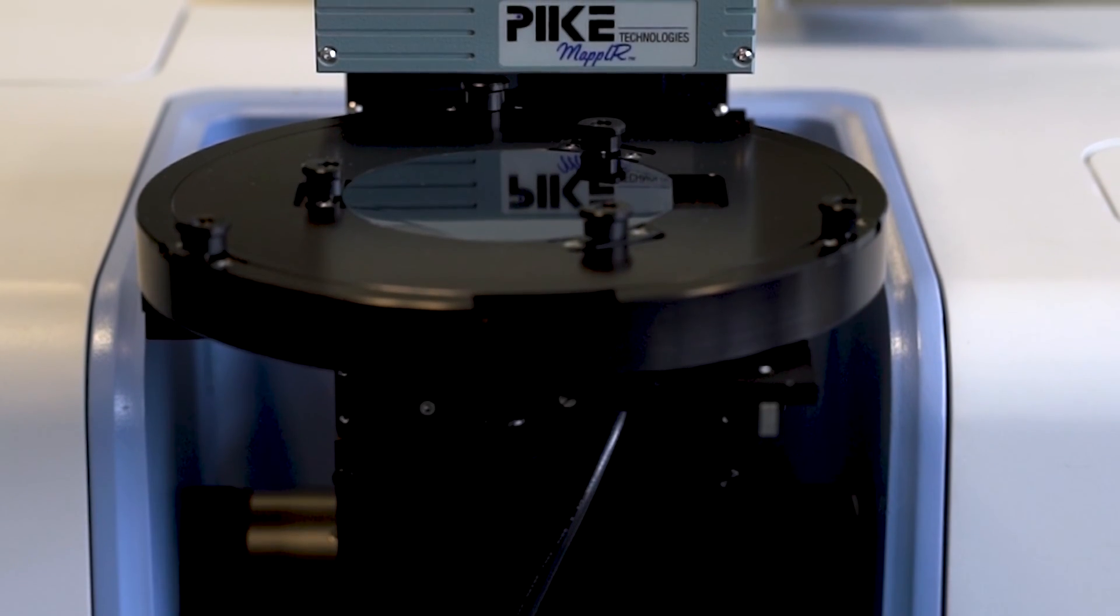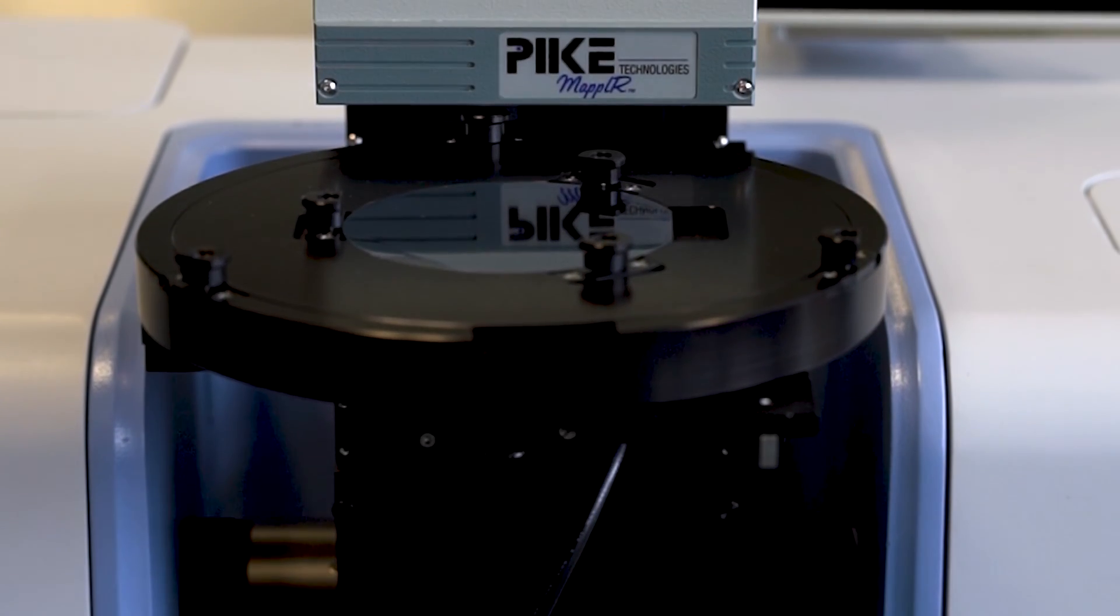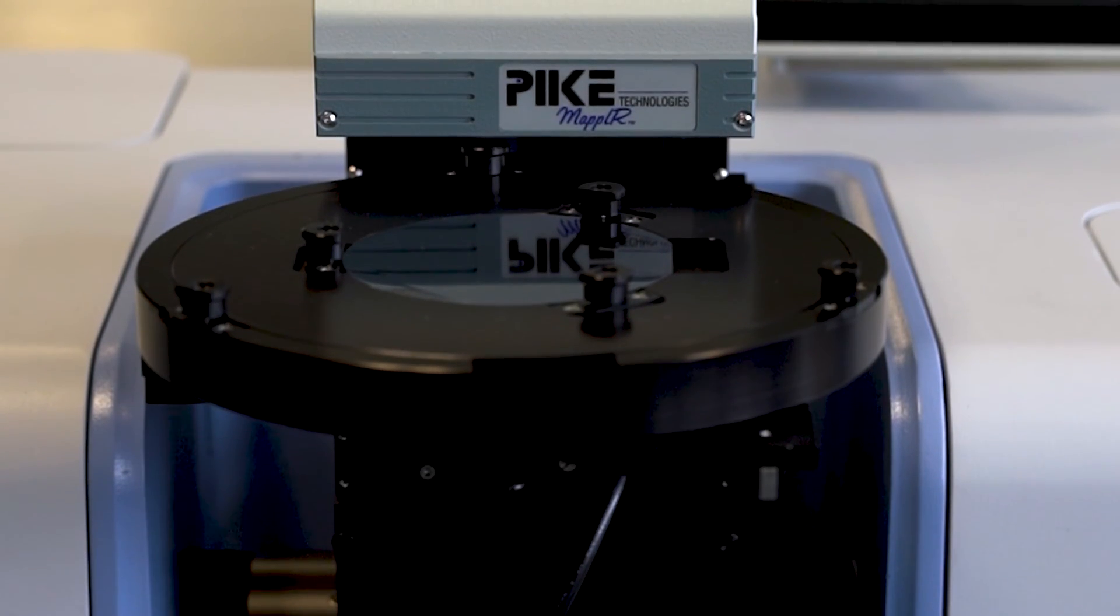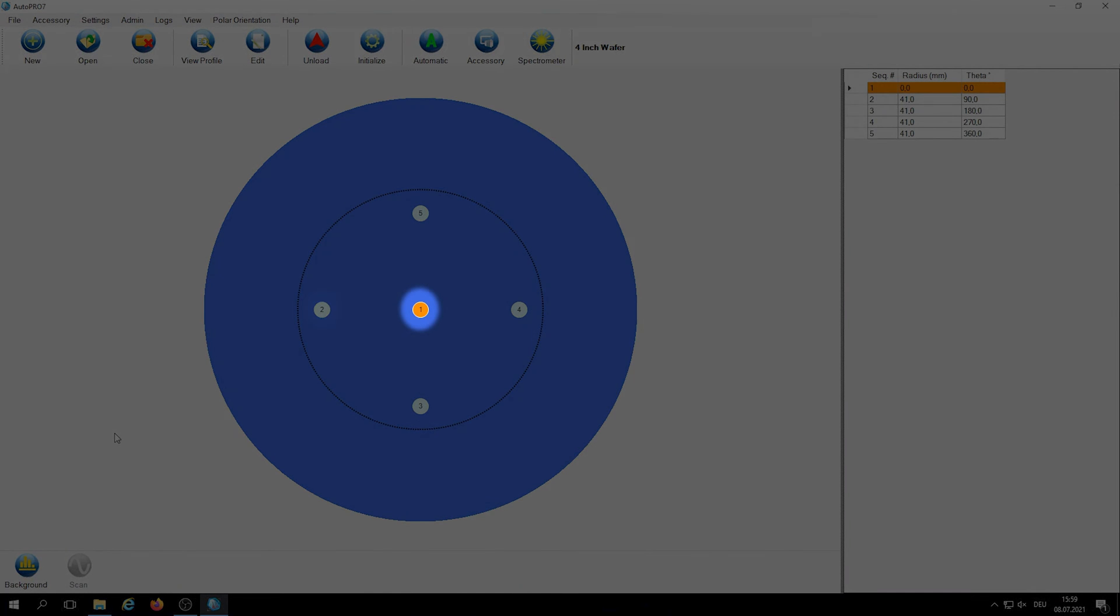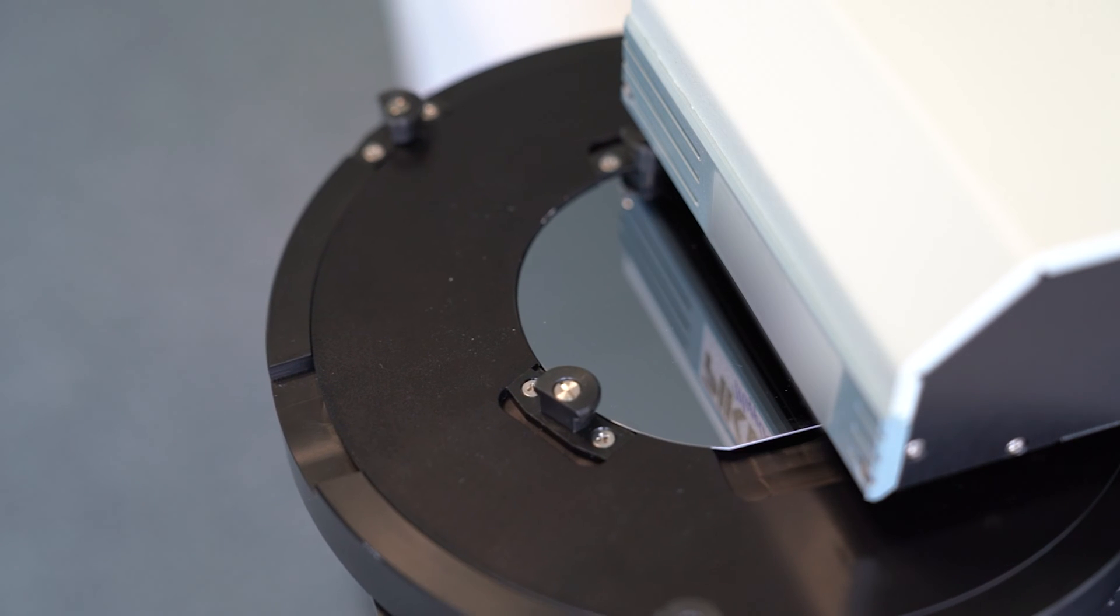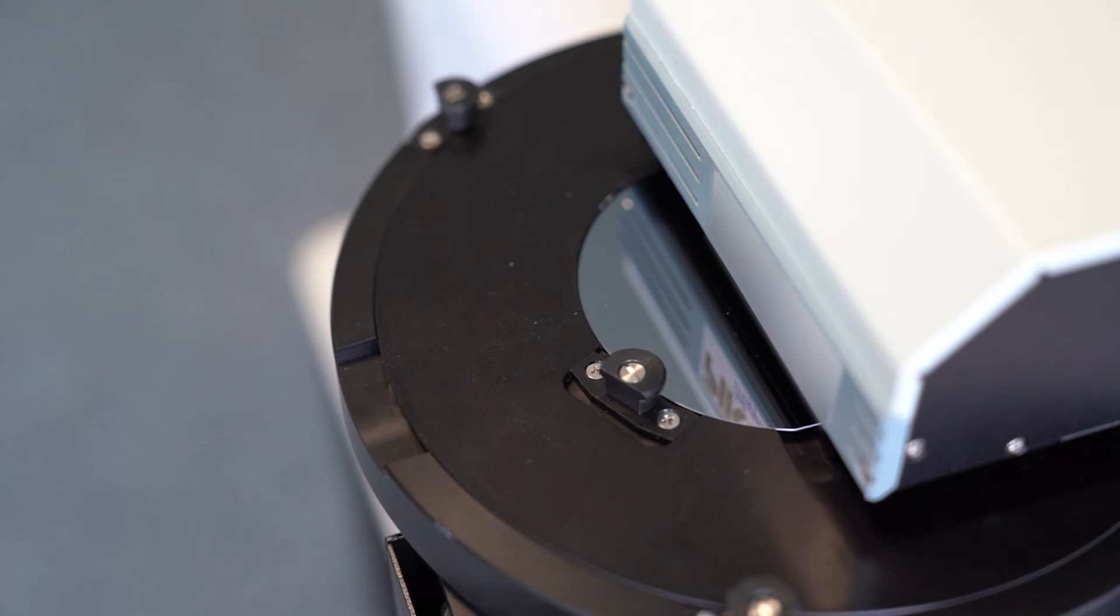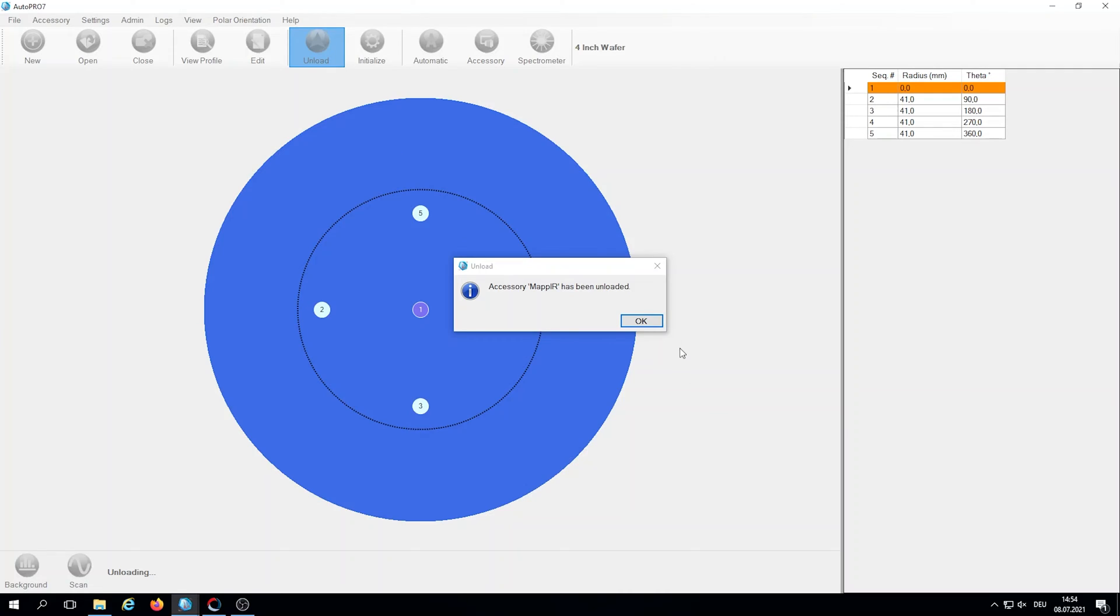We'll use the Map IR accessory to collect the IR data. We can specify how many data points we need, and then the Map IR will load the sample and we can begin the scan.